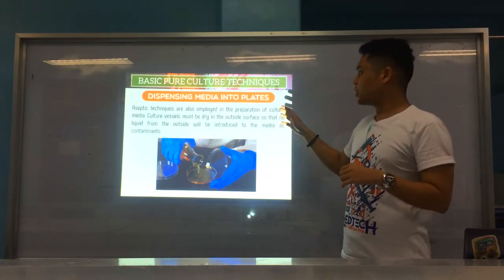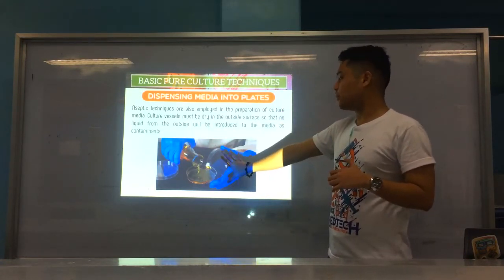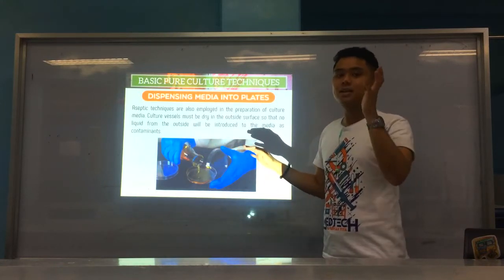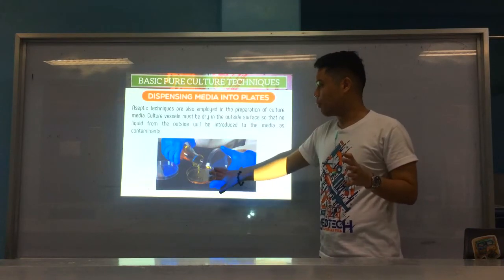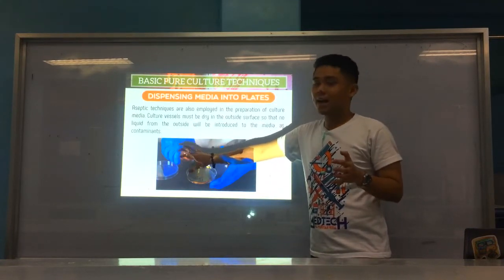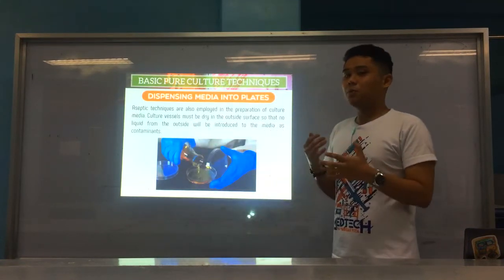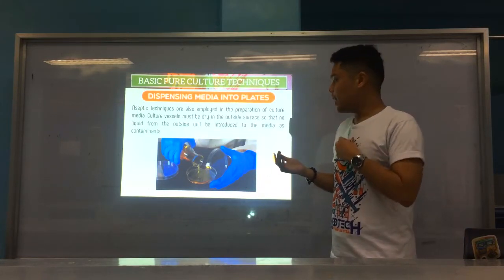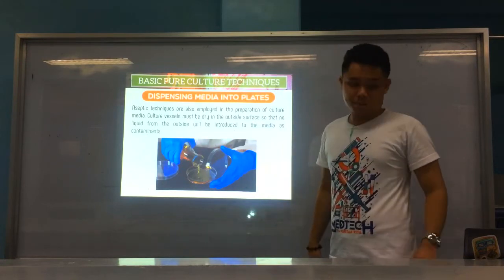So when you come to dispensing, the plate should not be left open for long, unless you're in a BSC. If you're on a countertop, it should not be open. And there should be a flame near you, like an alcohol lamp or a Bunsen burner, because again, this will promote at least an aseptic environment where you work. Okay? Alright, so again, that's for dispensing media into plates.